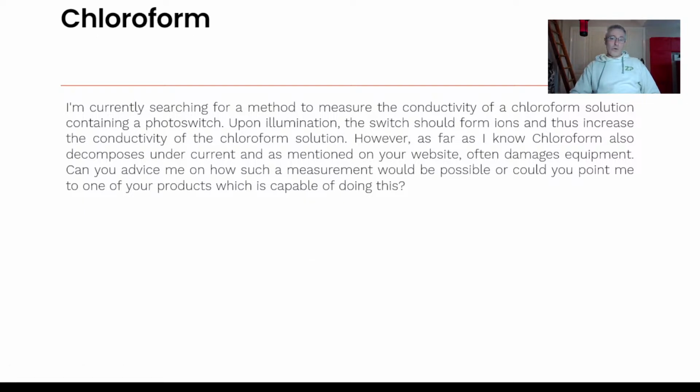And chloroform is an organic solvent, so I can absolutely understand that chloroform gives them a bit of a problem because it will chemically attack lots of screen printed electrodes. At ZP, we actually do have a range of screen printed electrodes that are very organic solvent resistant.